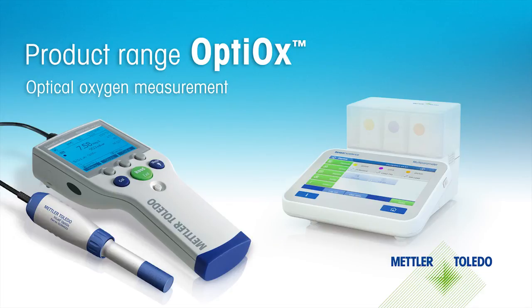METTLER Toledo presents the new Optiox product range for the measurement of dissolved oxygen. Experience the fascination of the optical measurement technique and all its advantages.